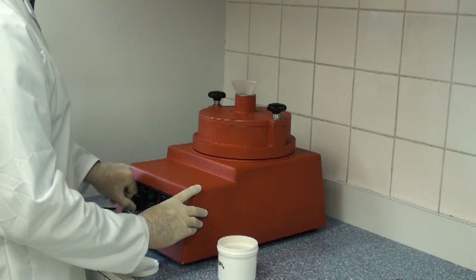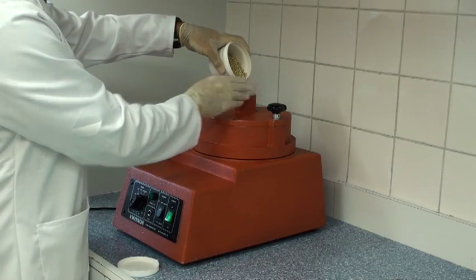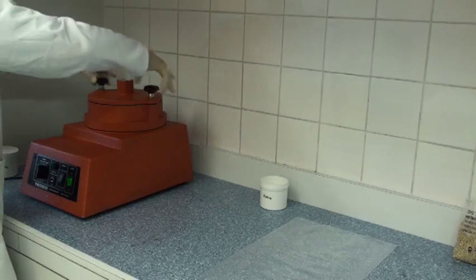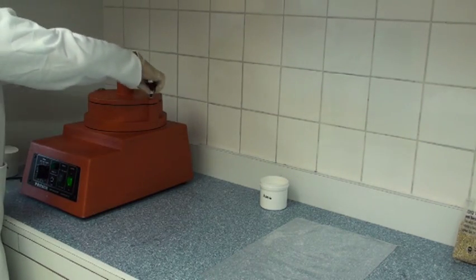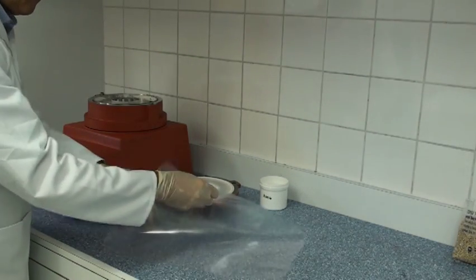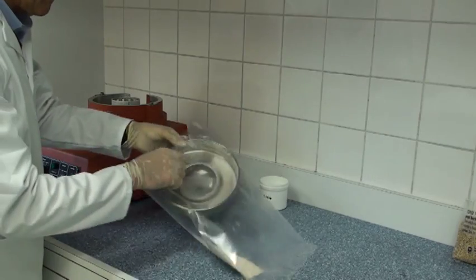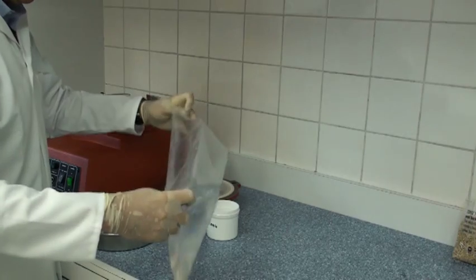Grain or malt samples are milled to pass a 0.5mm screen using a Frisch or Retsch centrifugal mill. After milling, the mill lid is removed and the sample is transferred from the collection tray to a plastic bag. This is then transferred to a plastic storage container for convenience.